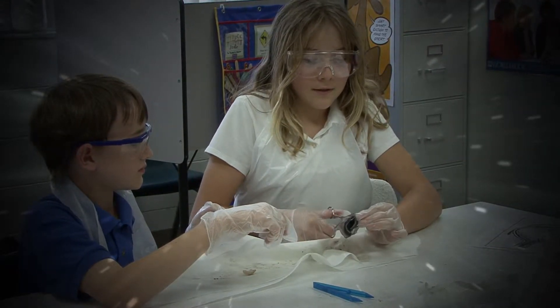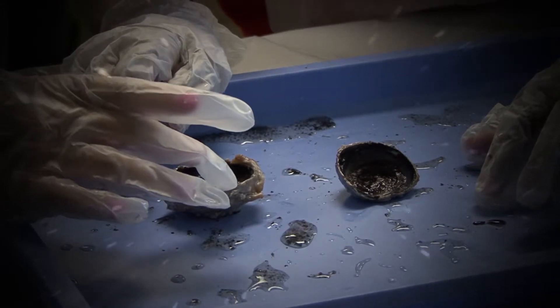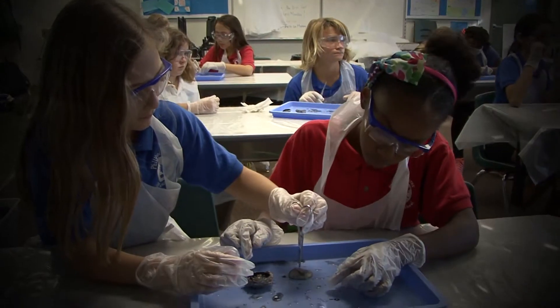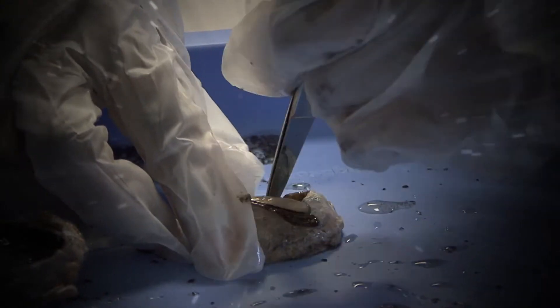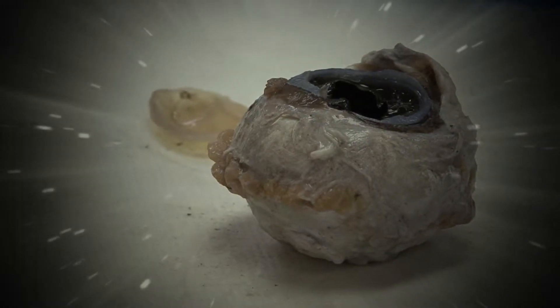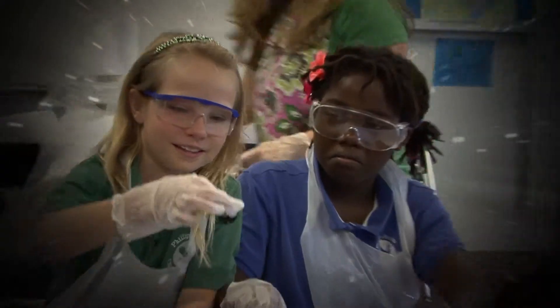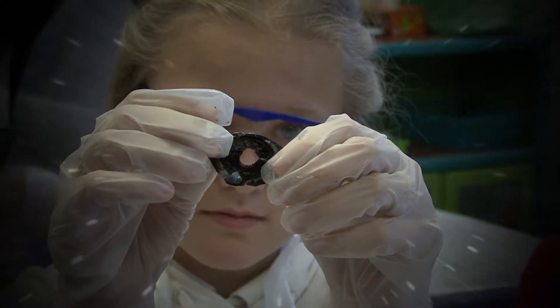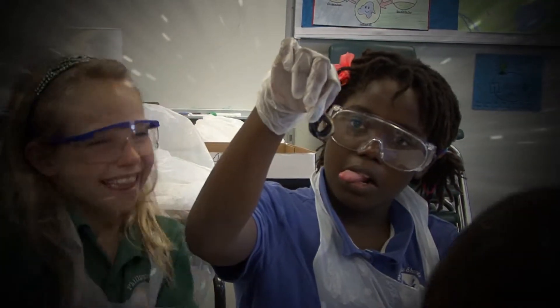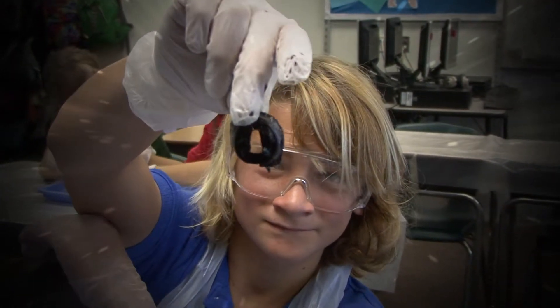Cut it into two — do not take anything out. The part in there that looks like it has a bunch of little lines — peel that out carefully so you can try to keep it as a whole piece. The iris is a muscle, and the pupil is not a black structure — it's actually a hole in the middle of your iris that allows light to pass through it, and that hole changes size to accommodate the amount of light you need.